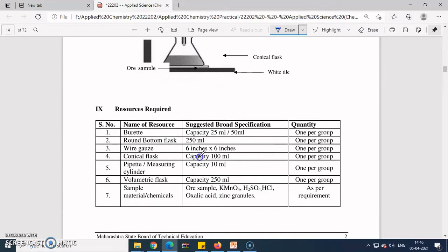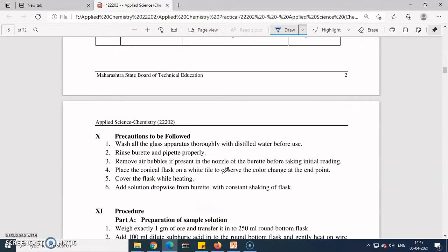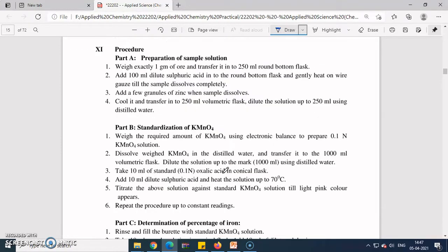The resources required for this experiment are: burette, 500 mL beaker (instead of round-bottom flask), wire gauze, conical flask, pipette, measuring cylinder, and volumetric flask. Chemicals needed include: ore sample (fine powdered hematite ore), KMnO₄ (potassium permanganate), sulfuric acid, hydrochloric acid, oxalic acid, and zinc granules.